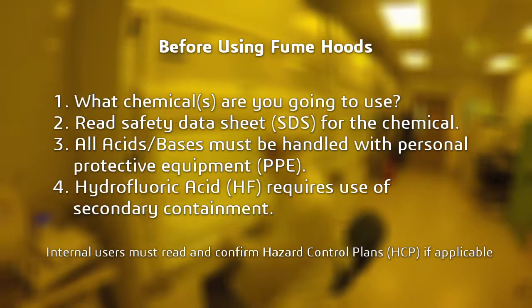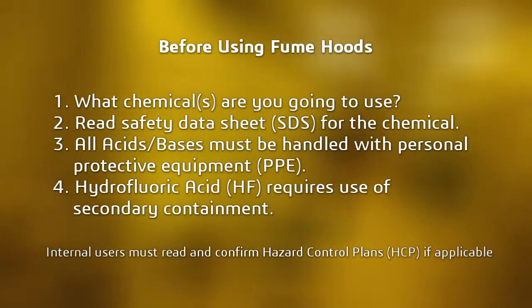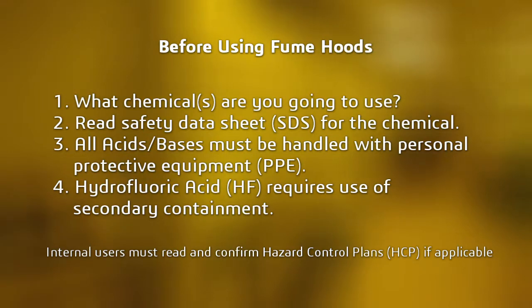Before engaging in a chemical experiment, plan out what chemicals you are going to use, read all safety data sheets, and ensure you are using the correct PPE and, if necessary, secondary containment.